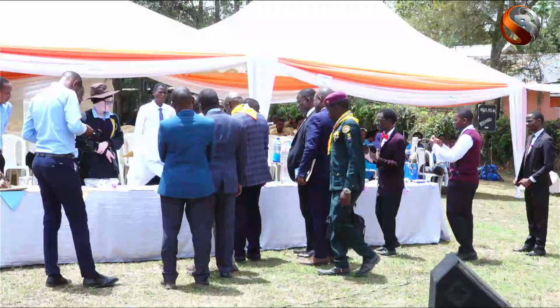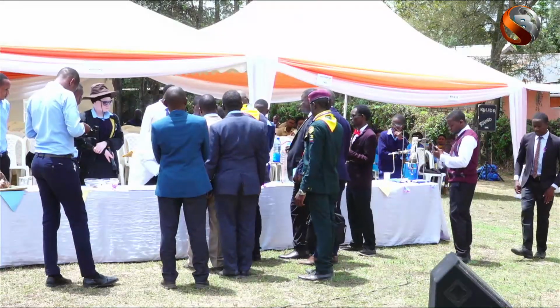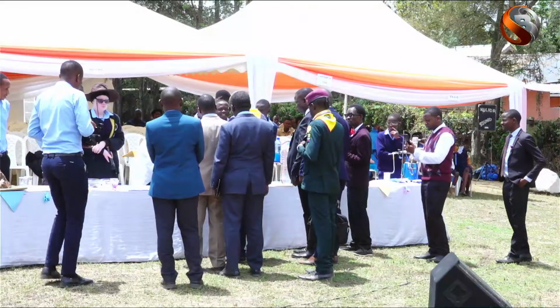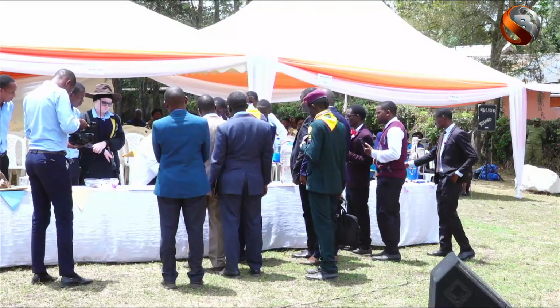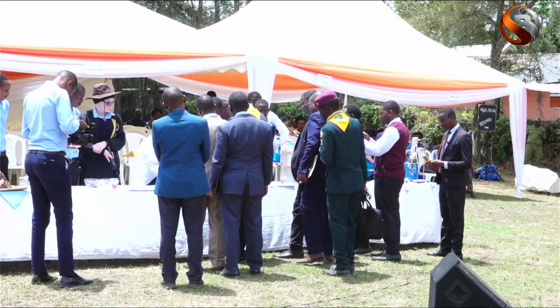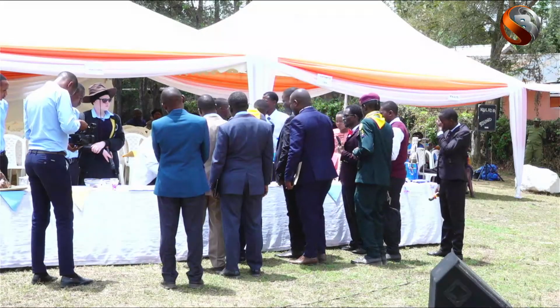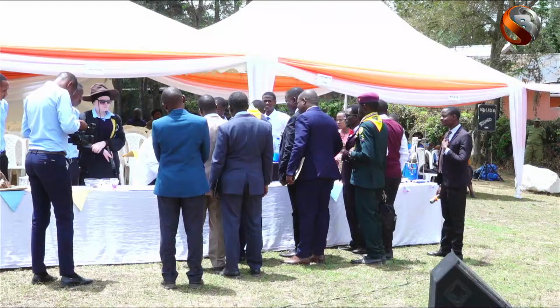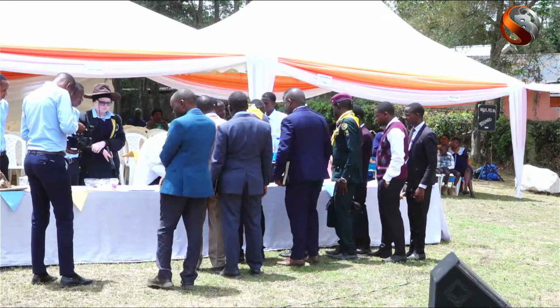Dear guest of honor, in front of you we are Form 6 students. Good afternoon. My name is Riley Mugini and my friend is Raymond Poo. Today we are coming to demonstrate the dissection, and in front of us we have a rat. This is an organism from kingdom Animalia, phylum Chordata, and class Mammalia.